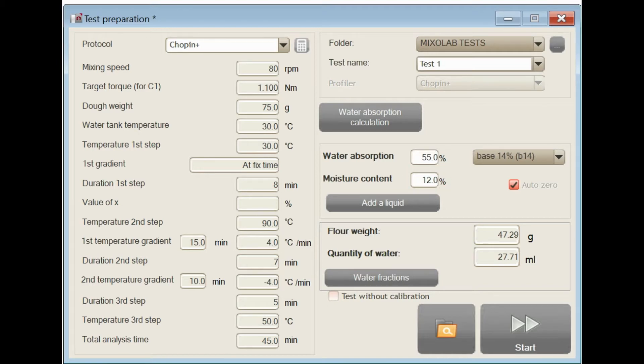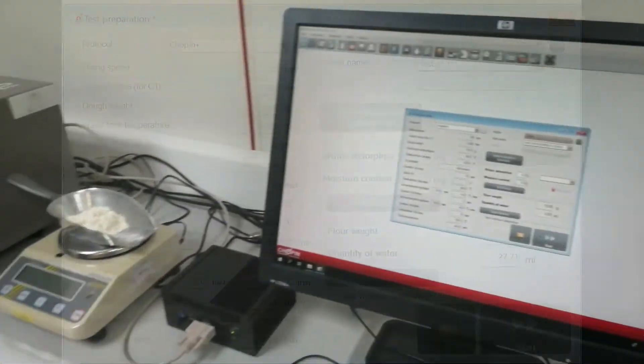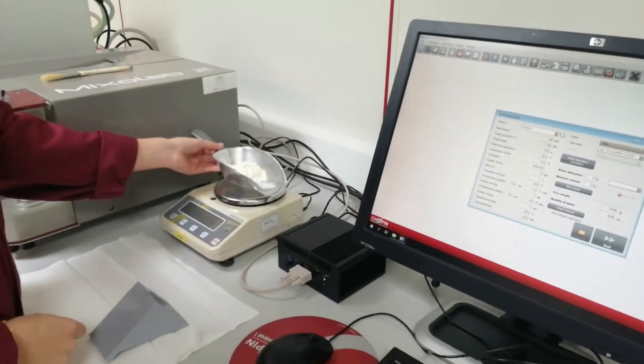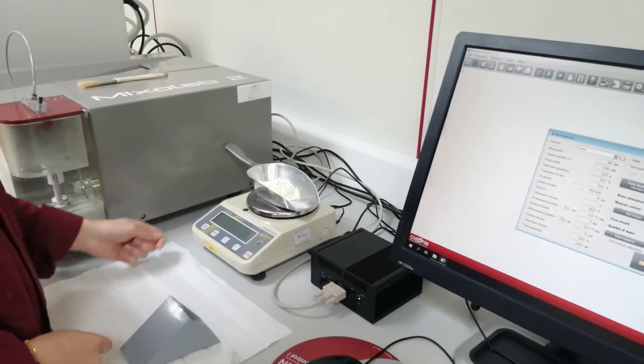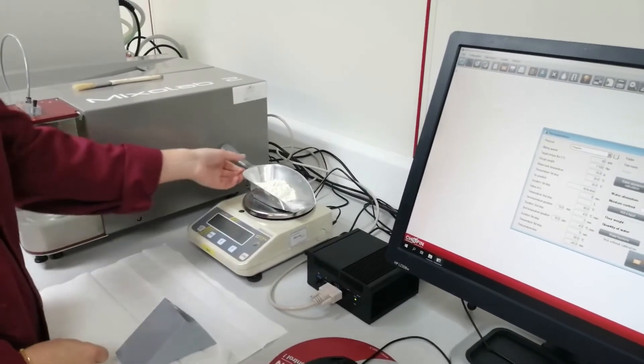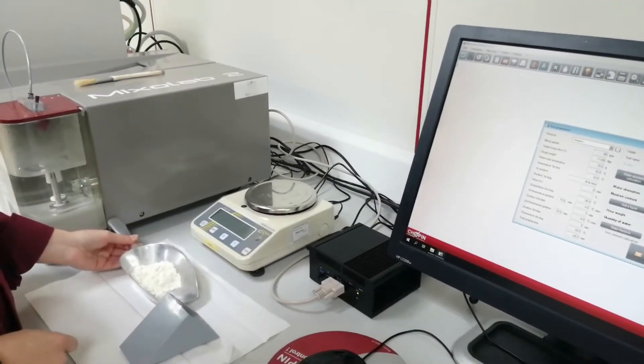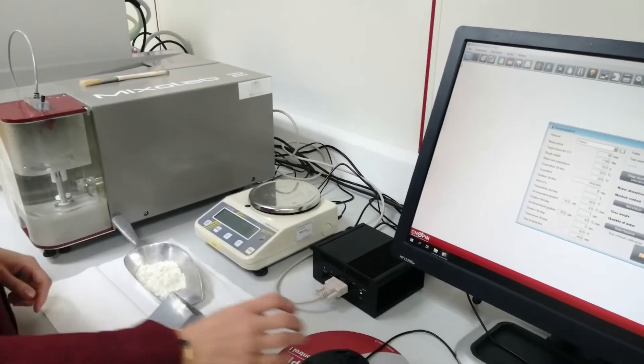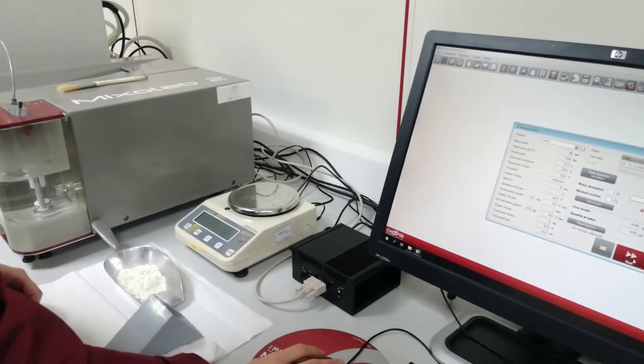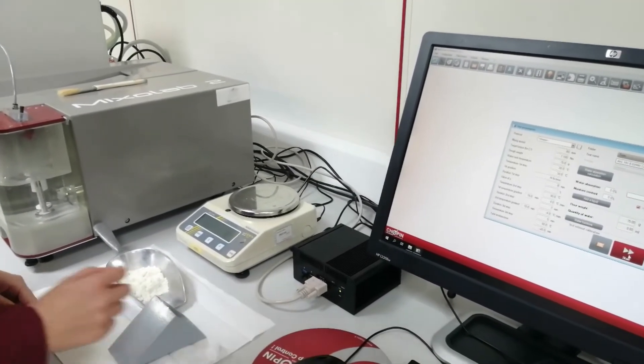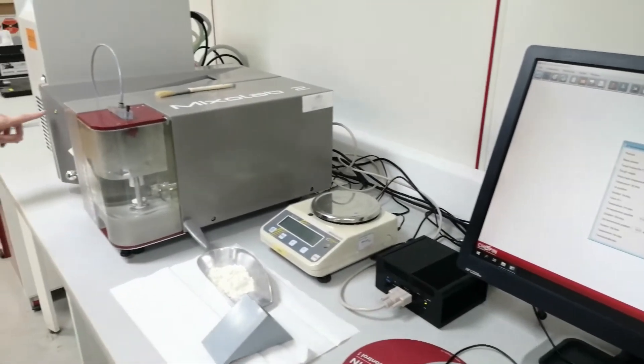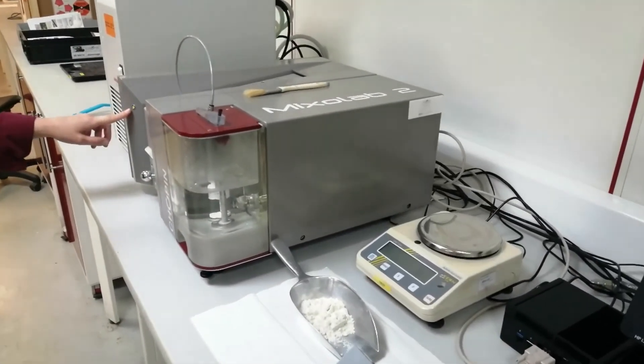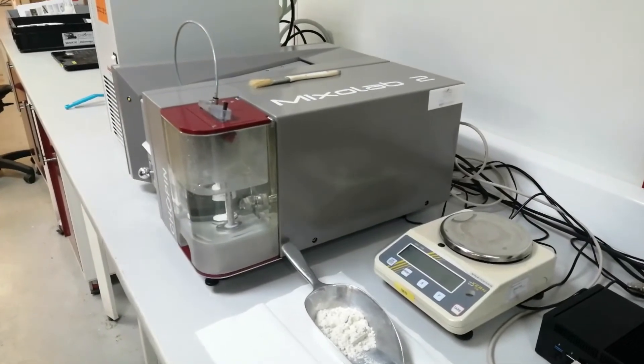Once all the information is put in, the software will automatically calculate the flour weight to be prepared. You are going to weigh out the quantity of flour indicated by the software to an accuracy of plus or minus 0.1g and leave it close to the Mixolab. At this point, all you need is to click on the Start icon on the software to launch the test. The LED will turn orange, which means that the test is underway and blades will start to run.